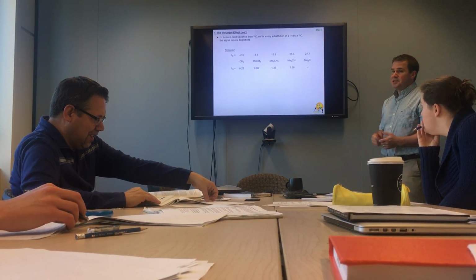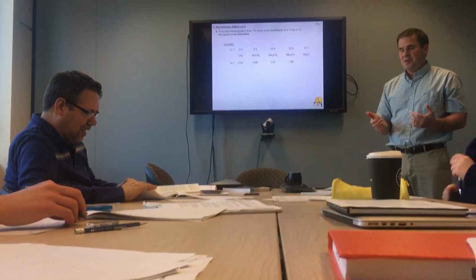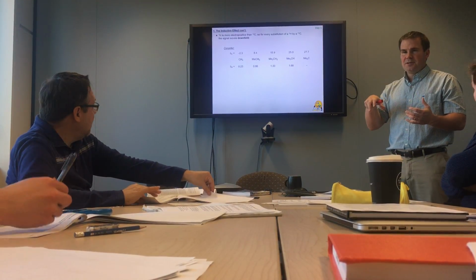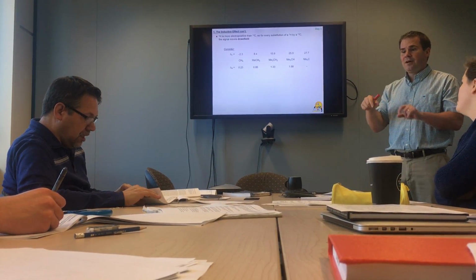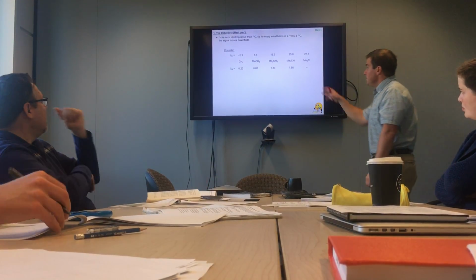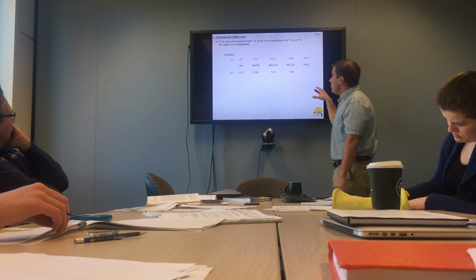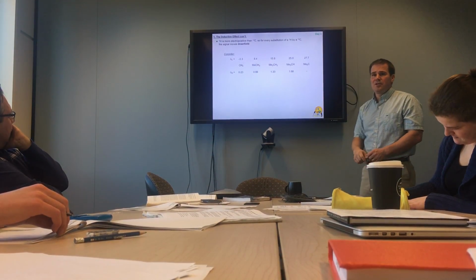This is important because when you're predicting what your NMR spectrum for a given compound might be, you might well have a comparator molecule that's very, very similar, but maybe lacks an alkyl group. So you can think, well, what happens if I were to replace that hydrogen atom there with that alkyl group? That middle carbon is going to move downfield. Really useful to remember the trend and by about how much you're moving every time you replace a proton with a carbon. More or less, you're moving by about 8 parts per million in a carbon sense.